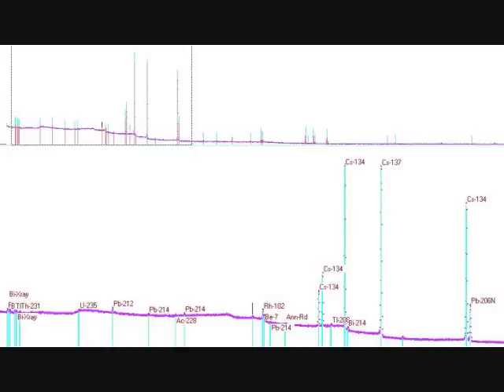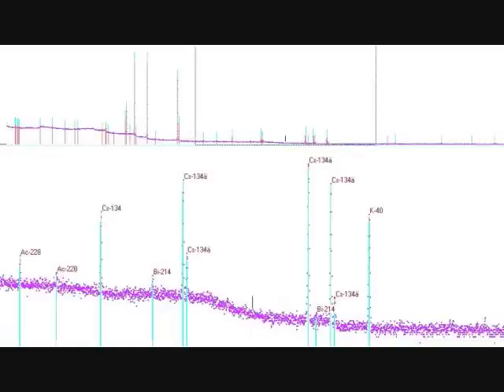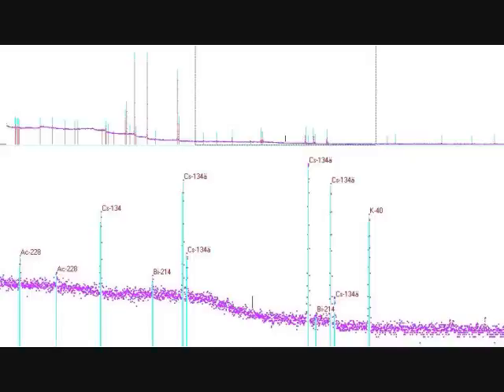And, as for some of the other isotopes, like the beryllium-7 peak is likely to be associated with cesium-134. And some of the other isotopes are actually natural, or from the lead shielding around the detector. And here we have the middle bit of the spectrum, and you can actually see some more natural lines, but a lot of those cesium-134 lines. Cesium-134 has a lot of different gamma lines, so we can see a lot of those. And you can also see the potassium-40 line, which is absolutely normal and will be in basically everything you analyze, even if it is just from the bricks that the place you have the gamma spectrometer in is made out of.